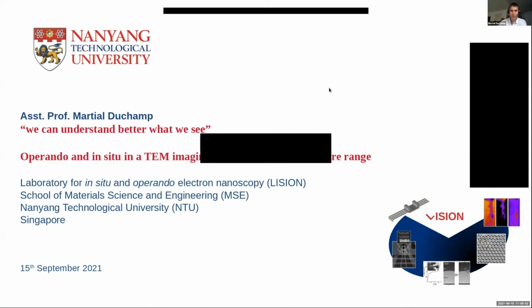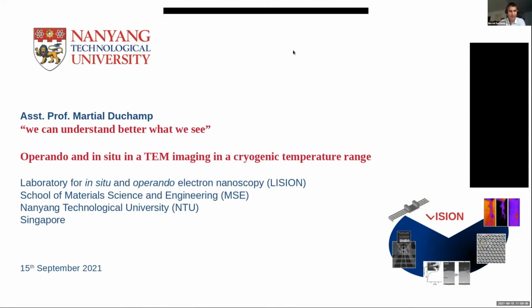So, as I said, thank you a lot for the nice introduction, and good afternoon, still good morning in Australia. It's a bit earlier on in Singapore. So today I will be talking about Operando and in-situ TEM experiments that I have been doing since now more than 4 years that I'm at NTU in Singapore. And as you will see, I will go through different topics to show what we can do and the various experimental capabilities that we have. I won't go deep into detailing each of these topics as I don't have enough time.